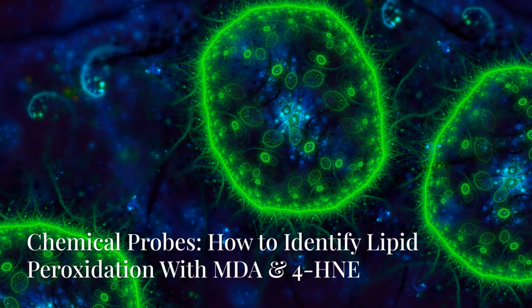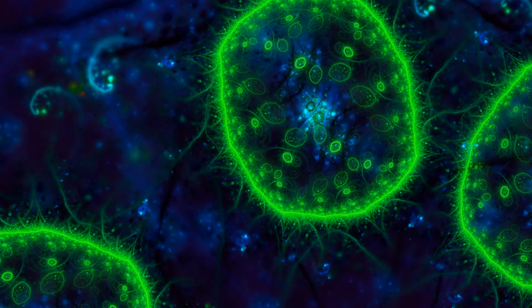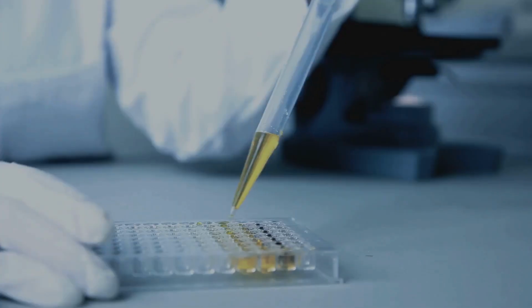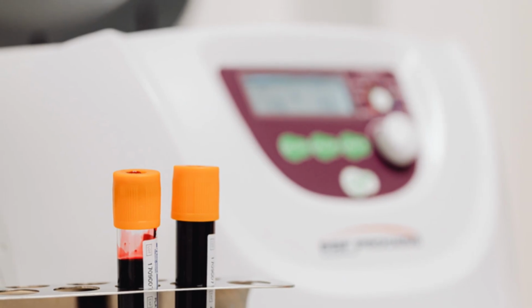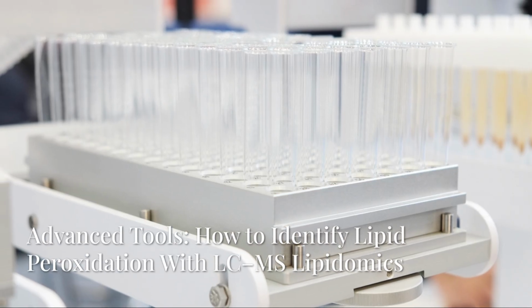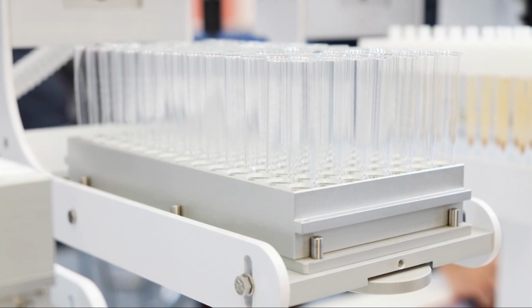cascade. Chemical probes: how to identify lipid peroxidation with MDA and 4-HNE. Aldehyde markers like MDA and 4-HNE are the most common indicators. Assays such as TBARS or ELISA quickly turn these molecules into measurable signals. If you want a straightforward answer to how to identify lipid peroxidation in biological samples, aldehyde detection is the classic, fast, and accessible method.